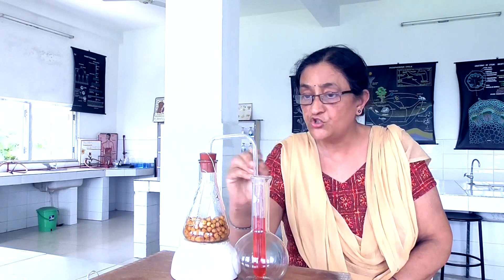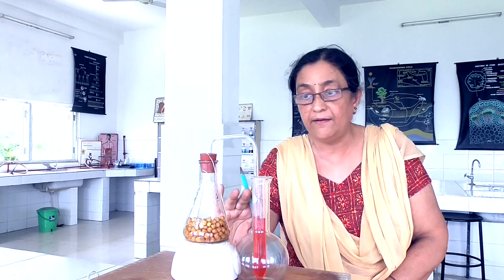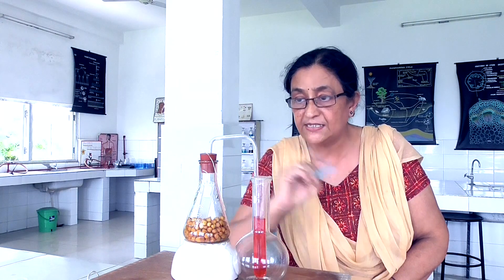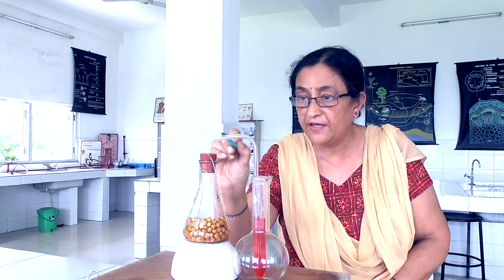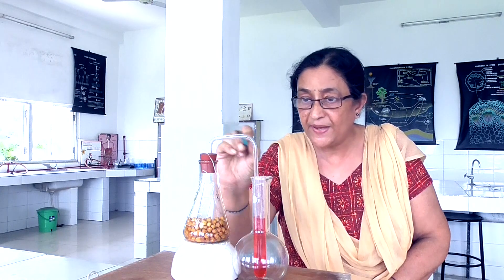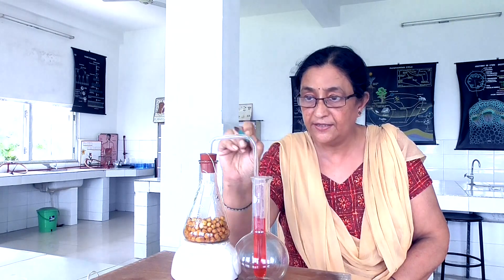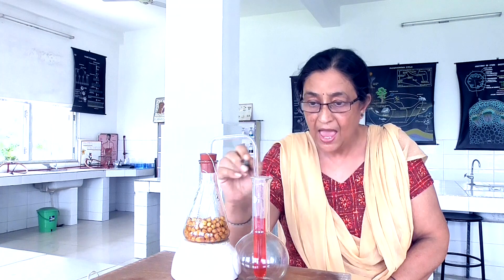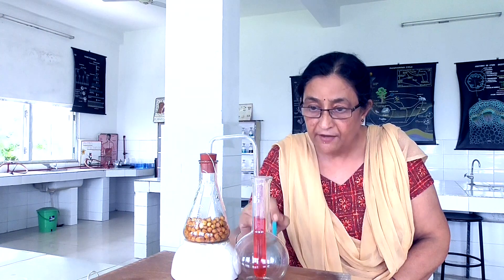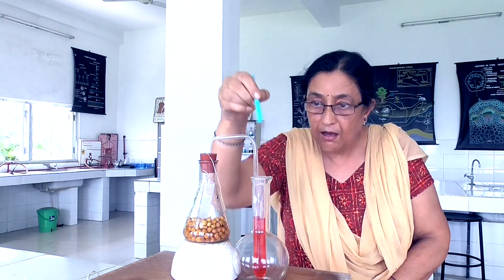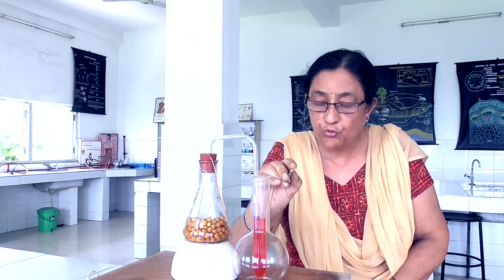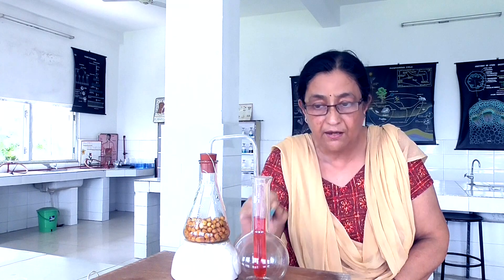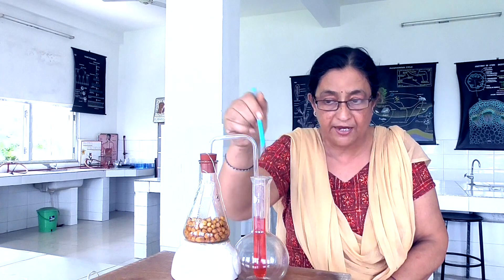The materials required to set up this experiment, as you can see here in front of you: one conical flask is taken, then you can see a rubber cock, then you can see a bent delivery tube — bent twice at 90 degrees. Then you can see one test tube, and the delivery tube is dipped inside the colored water. You can also take a beaker here; we have taken a test tube and kept it in a round bottom flask.